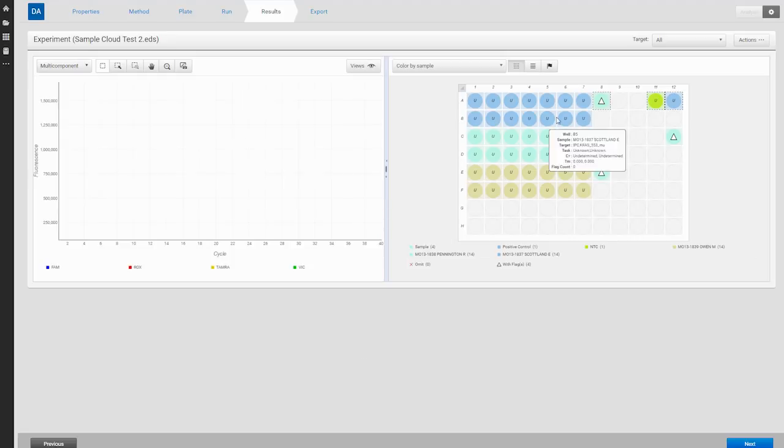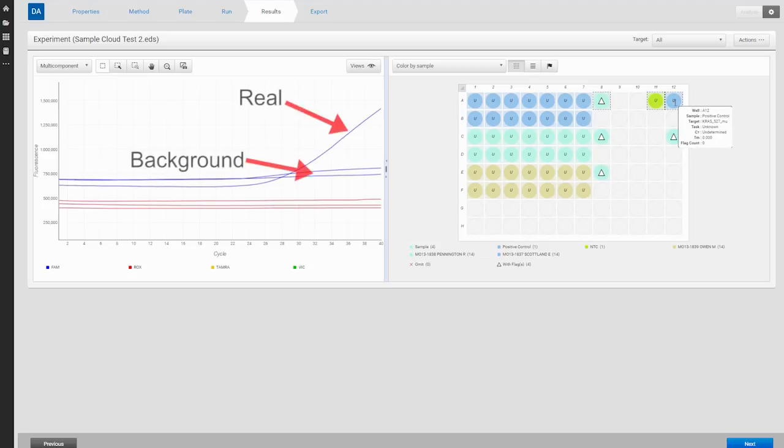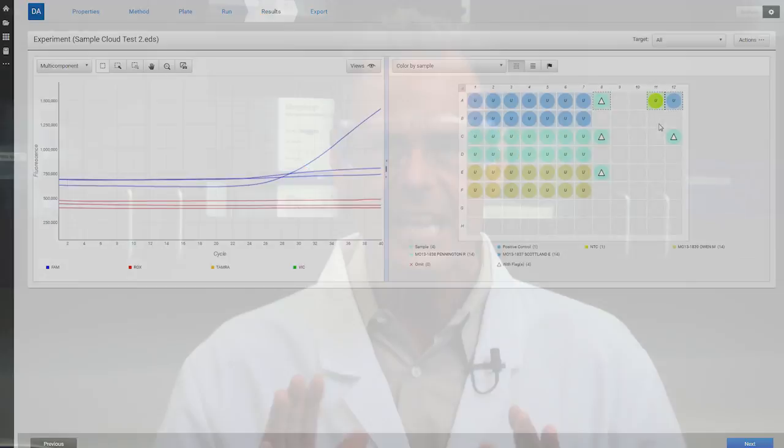We can see this in the multi-component view as well. This view shows the curves of each dye in the reaction at each cycle and is very useful for troubleshooting. In this way, we can check the curve's exponential amplification, which indicates real signal, as opposed to a linear upward drift, which can be caused by probe degradation at the end of the run. We can even overlay the wells with our no-template control samples and see that there's not much difference, so we can be confident that those wells did not represent real signal.